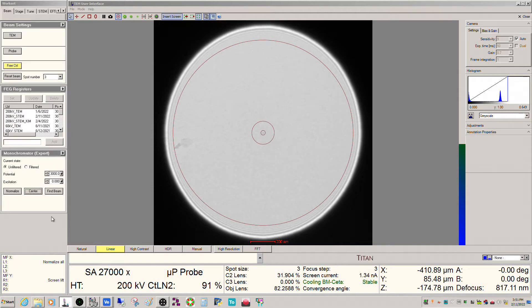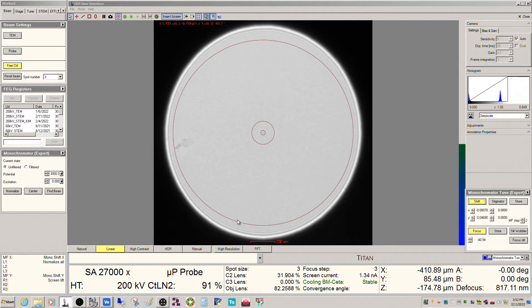So normally the panel you want here is the monochromator tune control panel. With an X-FEG and a monochromator, you no longer have a discrete gun lens — you have a gun lens that has a continuous value of focus, going basically from negative to positive. If I activate focus and shift, now my intensity knob is adjusting the gun lens, otherwise known as the focus, and my multifunction knobs are adjusting the shift for the monochromator.